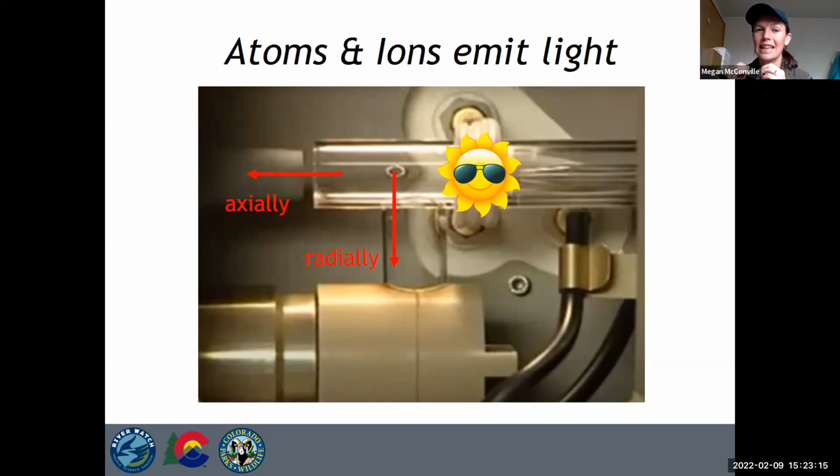So you're actually giving them a charge. So an ion is a charged particle, and those charged particles emit more light. So we want to create individual known ions that allow us to kind of see or know the concentration of these different elements and what's in your metals bottle. Does that help? Yeah.